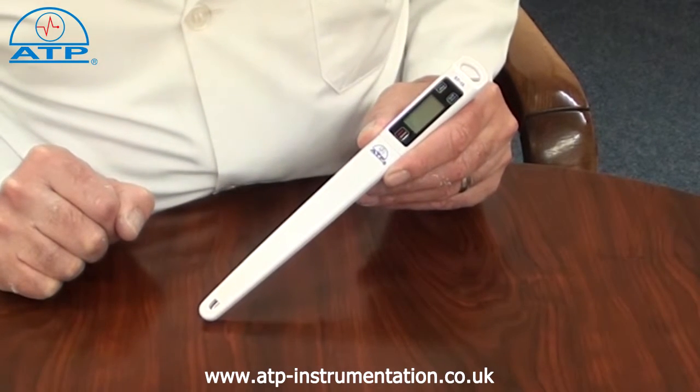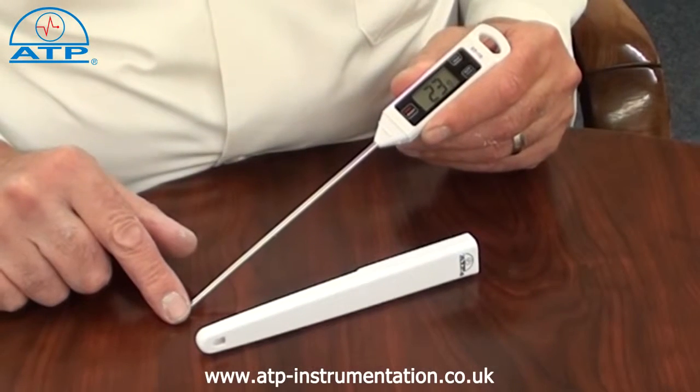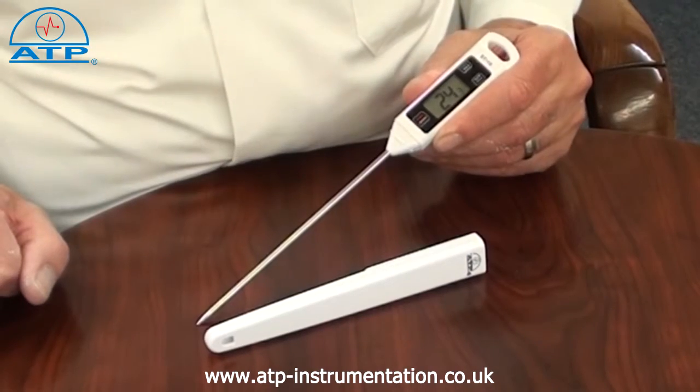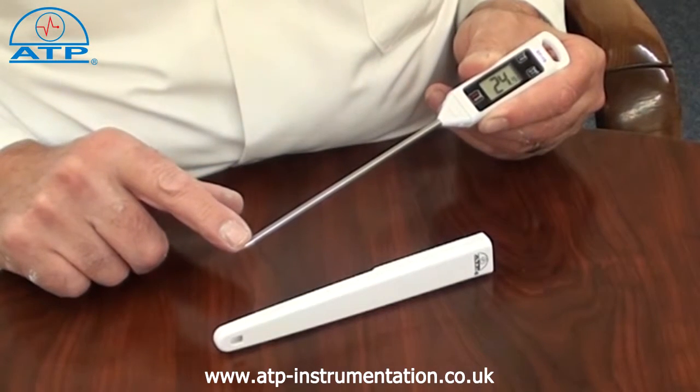There is an auto power off function after 15 minutes of no activity. The probe is 150mm in length with a 4mm diameter and made from stainless steel. It has a swaged pointed tip. The temperature sensor is located in the bottom 10mm of the probe.